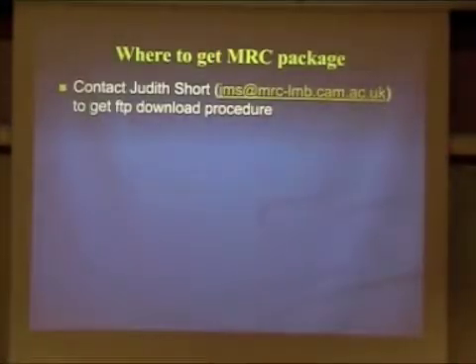Okay. Now where do you get this? Other than the one currently distributed with 2DX, if you want the full and updated versions from MRC, you have to contact Judy Short, and she will set you up for FTP download of the current version. Okay, so this is the introduction to the package itself. Any questions so far?